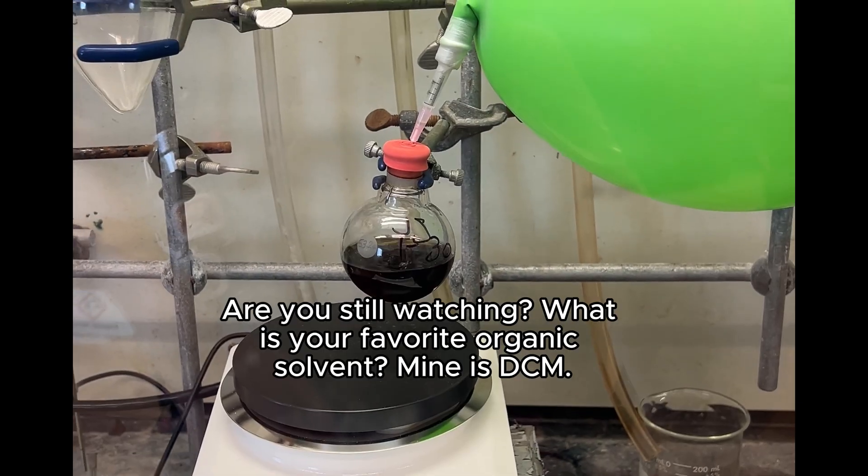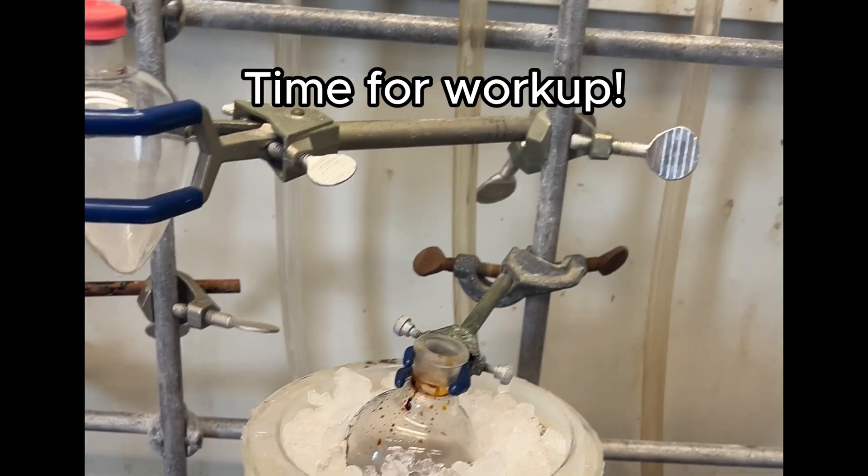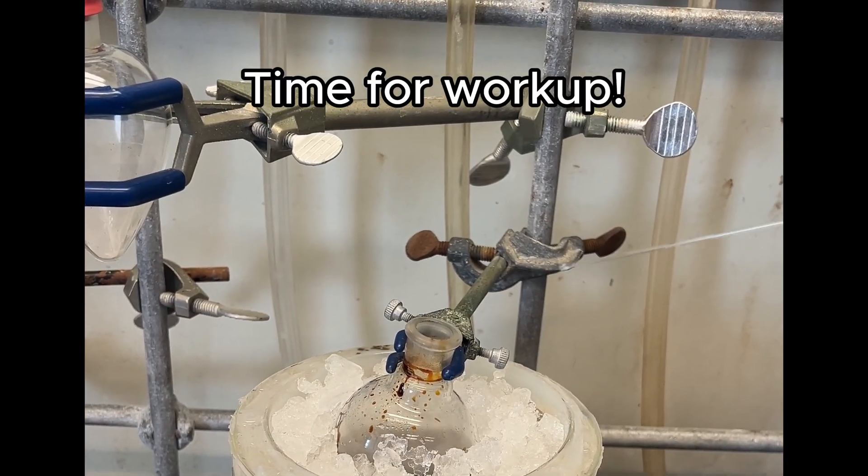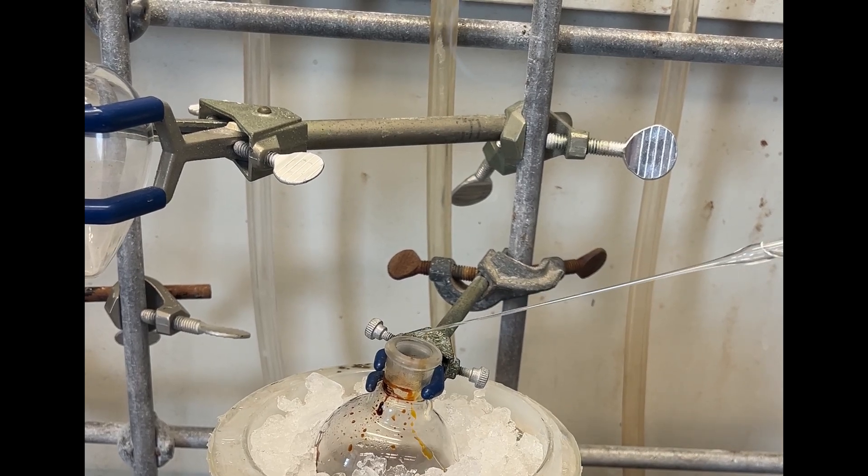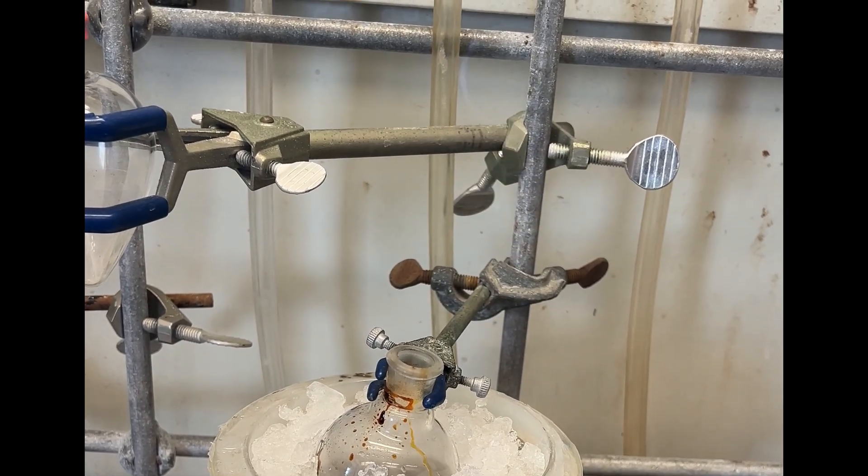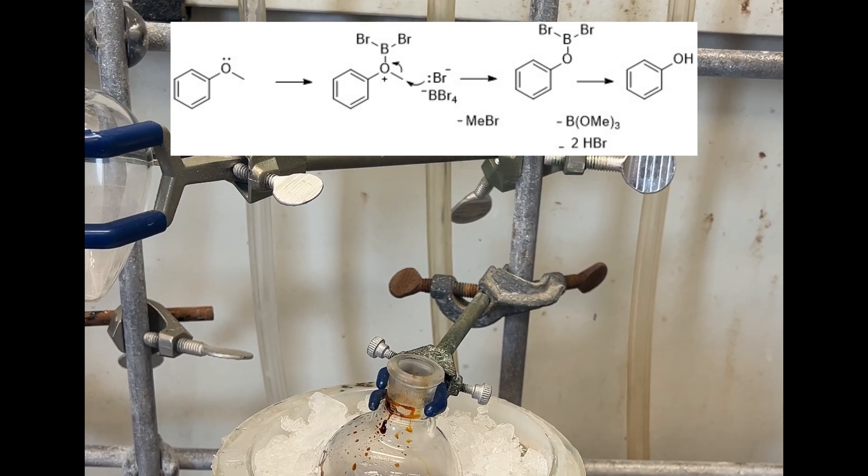So if you're still watching, what's your favorite organic solvent? Mine is DCM because it's easy to get rid of. Okay, now it's time for the workup. I'm going to be working up with methanol, very slowly at zero degrees behind your hood sash. You're going to do this with a long pipette, one drop every minute.